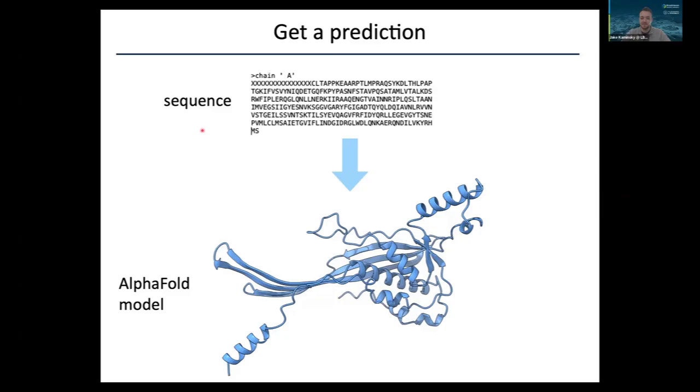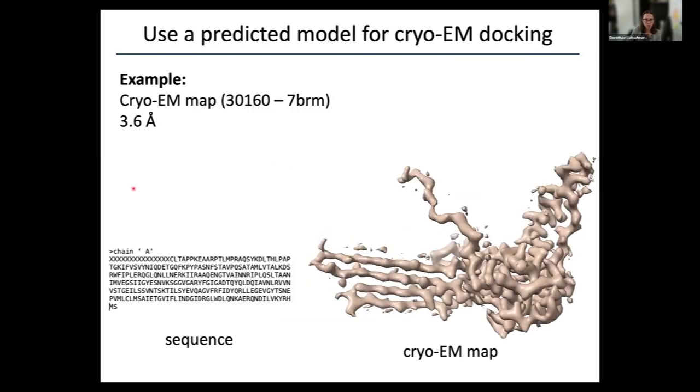Okay. For example, Pradeep, you said in the chat this is not a good prediction. Would you like to explain why you think that? Yeah, definitely. Because the conformation looks quite different to that of what you showed from the cryo-EM map. Okay, let's see if I can get back. Here we go.